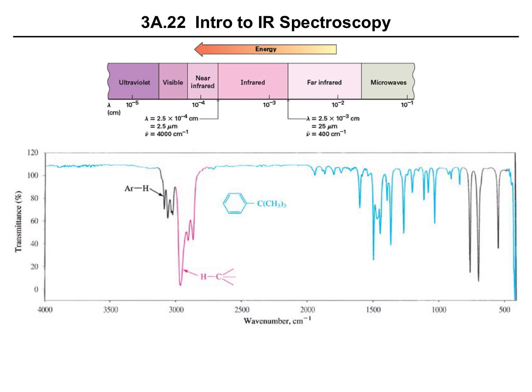Now, if we look along this axis, we can see this is given in wave numbers in inverse centimeters. Wave number has the symbol nu with a bar over it, and this is equal to 1 over wavelength. Now remember that energy is inversely proportional to wavelength.